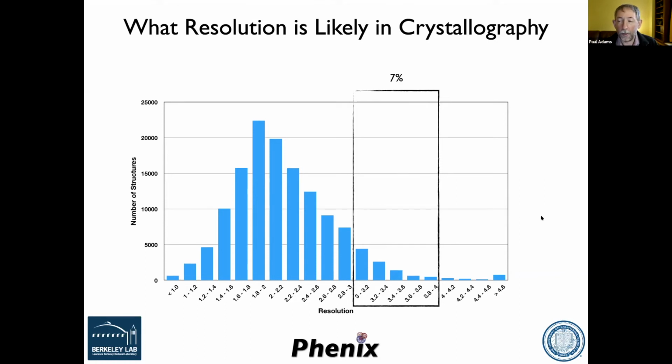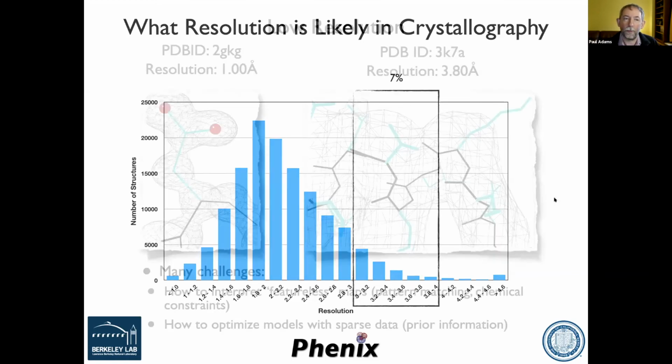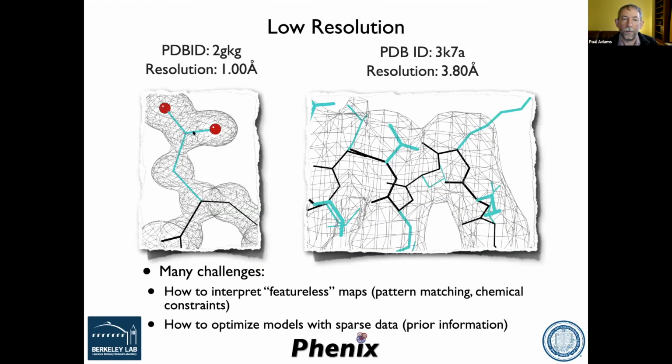And it's really the same problems that we see in electron microscopy at the typical resolutions people are working at, which is, if you're at 1 angstrom resolution, it's very clear what's going on. If you're at 4 angstrom resolution, it's very challenging to understand what this map, whether it's crystallographic or electron microscopy, is telling you. It doesn't really tell you where the side chains are.